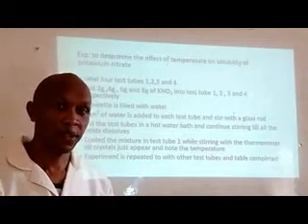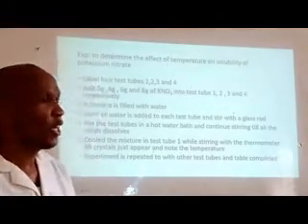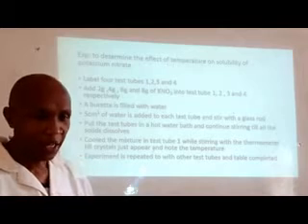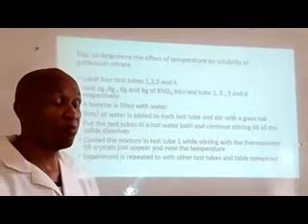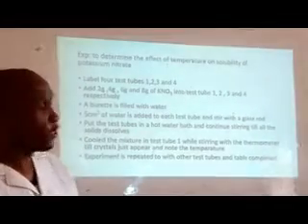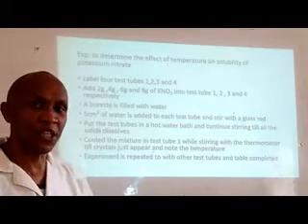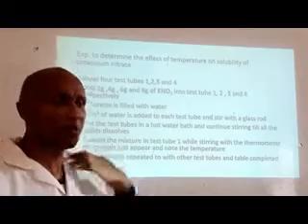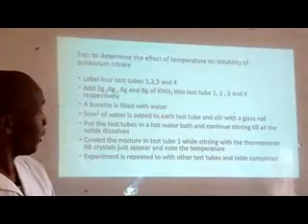The next thing that we do in this topic is to determine the relationship between temperature and solubility. And we shall perform an experiment to do that. And so in this experiment we shall be investigating the relationship between temperature and the solubility of potassium nitrate.